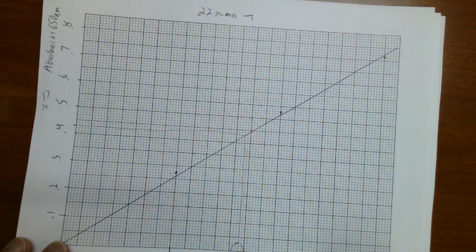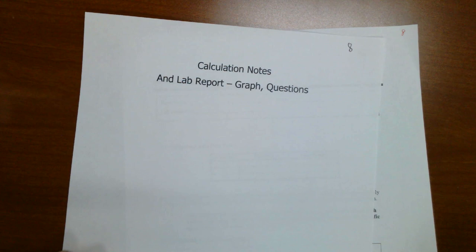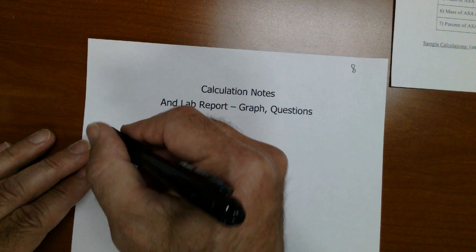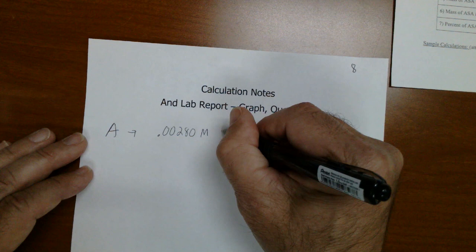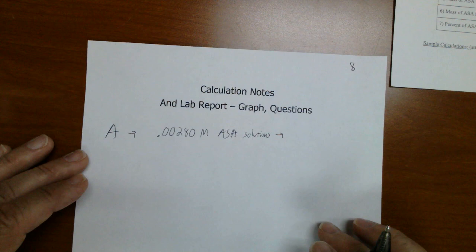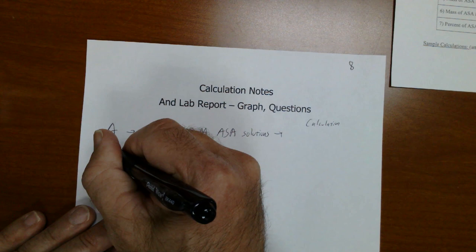Before I get into the lab, I do want to point out a few things with respect to the lab report and things that you'll be expected to do. In the very first part of the lab, we're going to run some calibration samples, and you're going to use some 0.0280 molar ASA solutions to prepare 3 standards. The instructions for preparing the standards are probably going to be discussed in the lab, but they're also in your lab report. So you need to show your calculations: calculate the concentration for solutions A, B, and C.